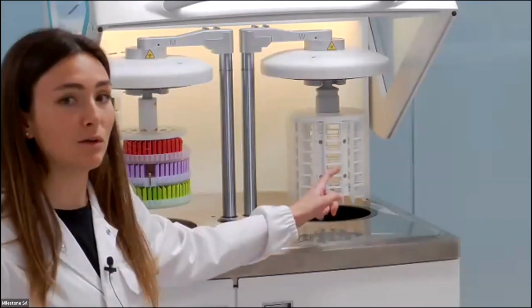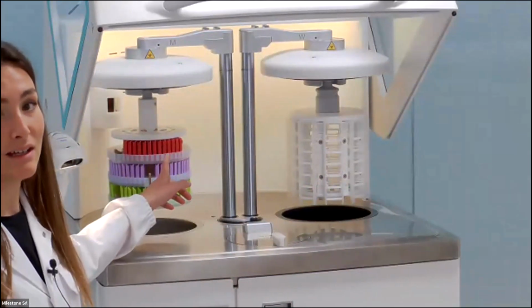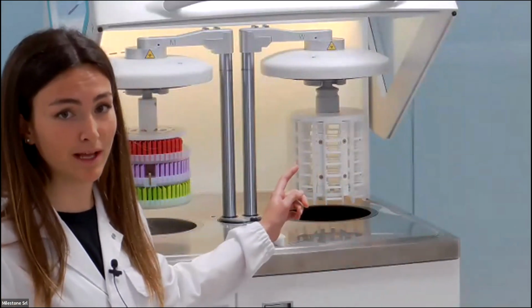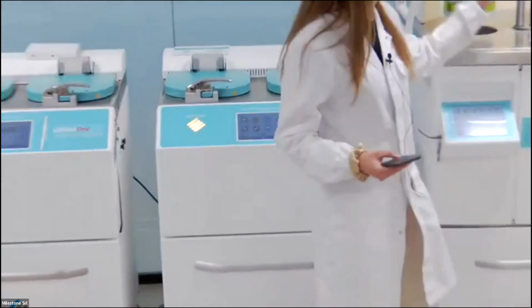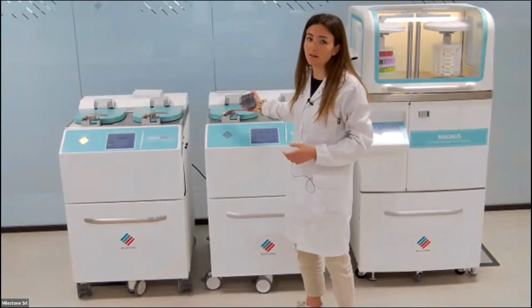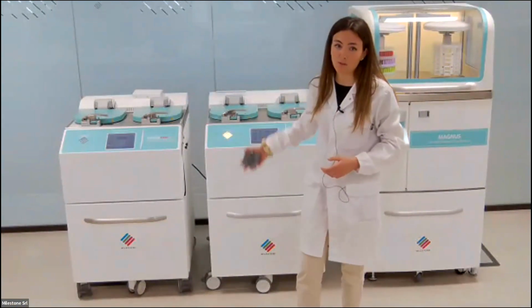It's not the wax that is moved, but the rack that is moved from the first to the second cavity. In Magnus, this movement is done automatically, while in Logos, in the dual run mode, it is done by the technician from the first to the second cavity with wax.